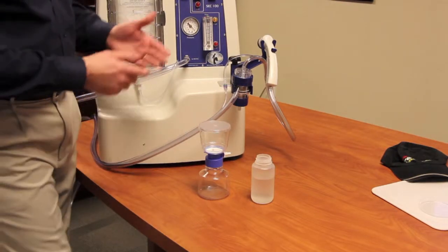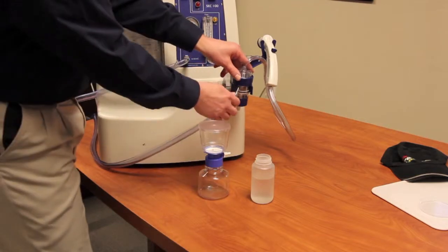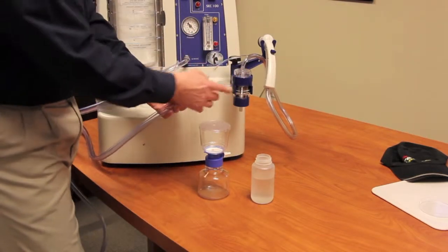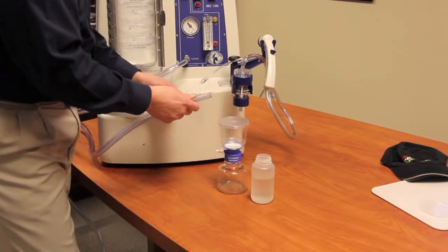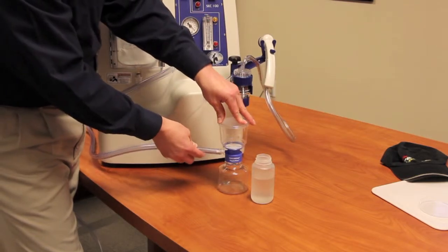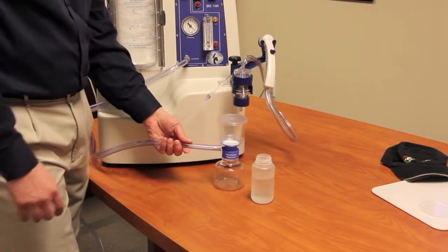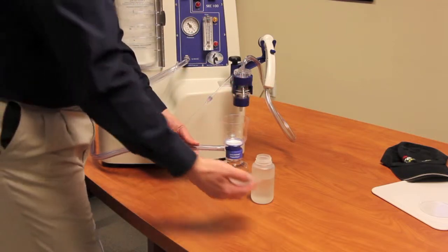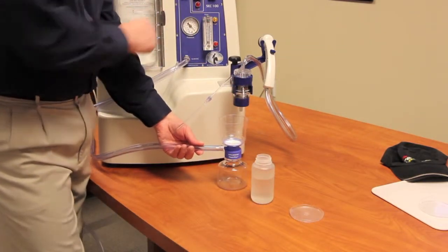What you want to do now is take the vacuum tubing off of the M-Vac. So you just work it back and forth until it comes off of that notch right there, and then you insert the vacuum tube, and you can pull this solution line off a little bit. You insert the vacuum tube right there over the top of the port on the filter apparatus. Pull the cap off, and then turn the vacuum pump on.